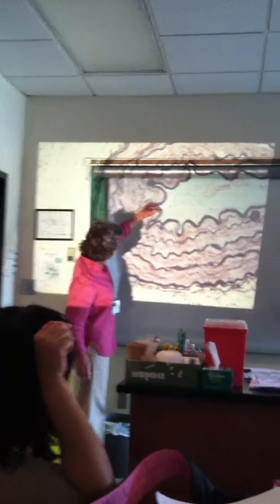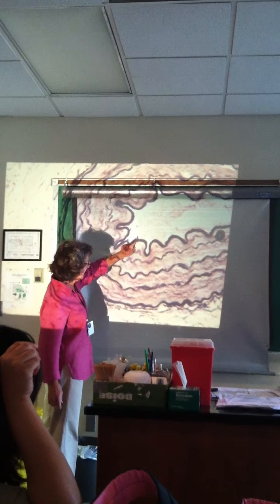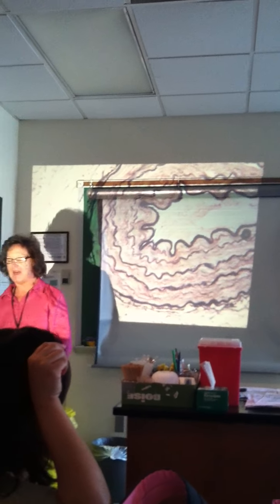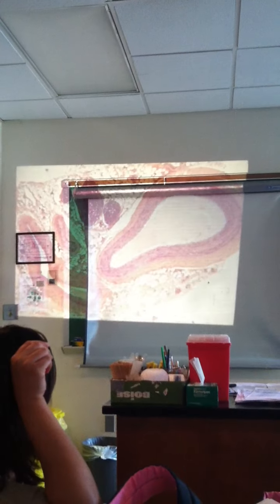There's one that's a little better. You see the purple nucleus peeling up. It's very flat. It's lumping up right here, flat. So if you had one row of flat cells right there, what is the name of that tissue? Simple squamous epithelium. Very nice. But there's nothing like looking through your own microscope to see this, which is how you'll be tested.